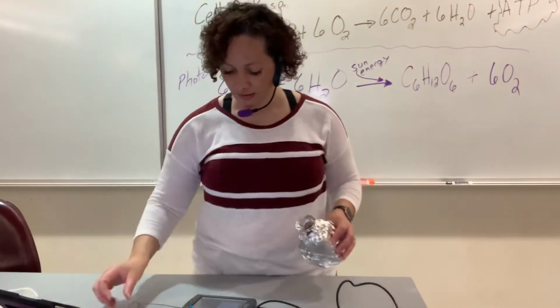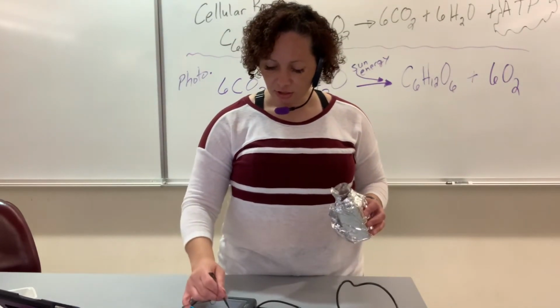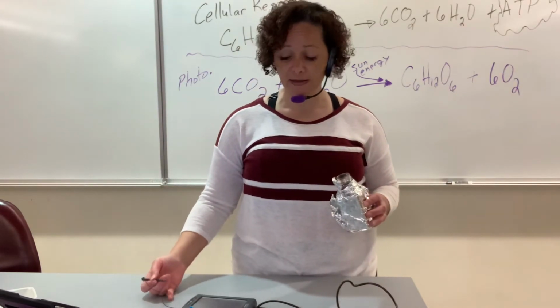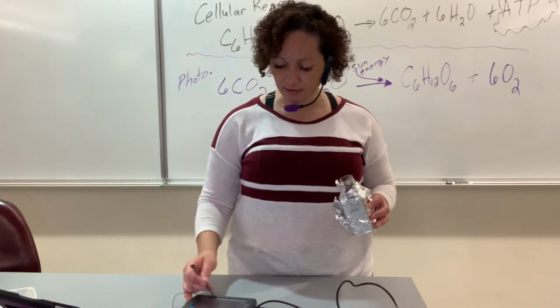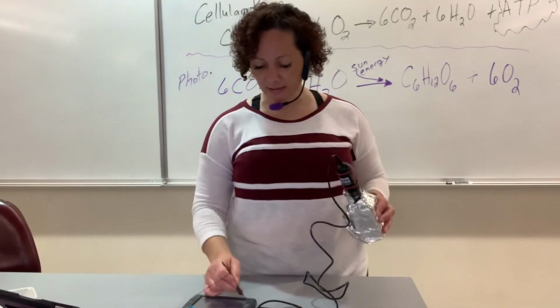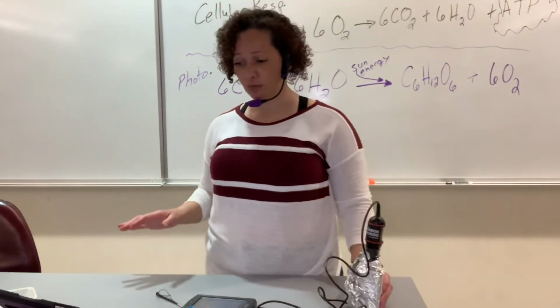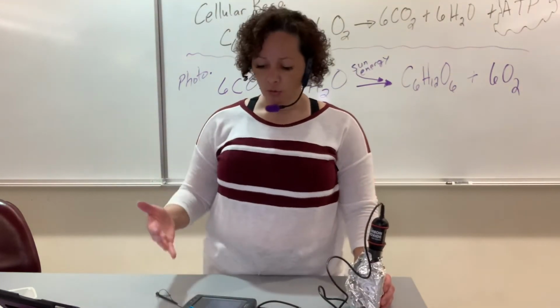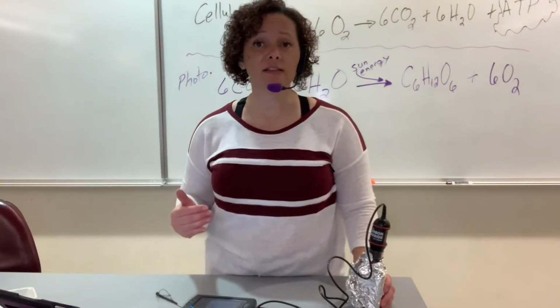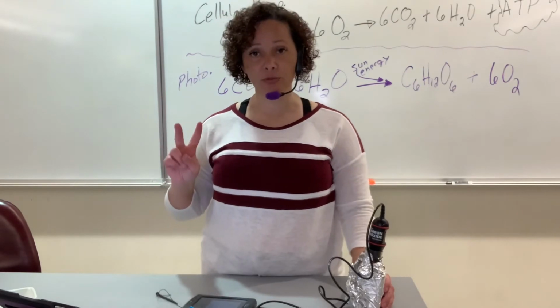And then clear your machine. You just hit File, New. Remember how I showed you in the beginning how to dump your files? Go ahead and discard it. Do it again. Boom. Run it. 3 minutes. Same exact thing that I just showed you. And then go through the process of analyzing your data and getting the slope, which is M, and you're going to write it for slope number 2.